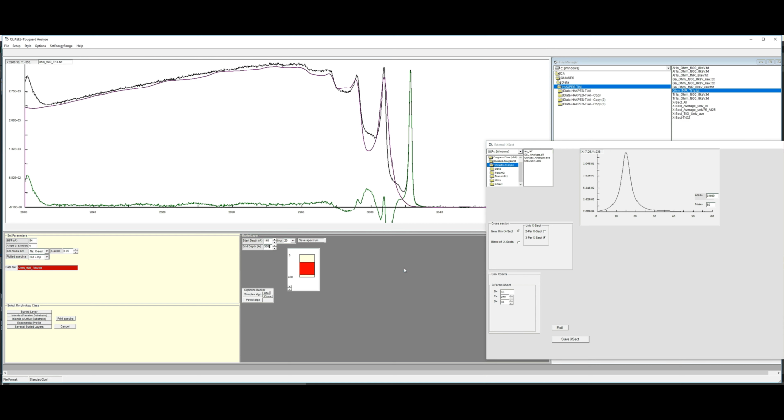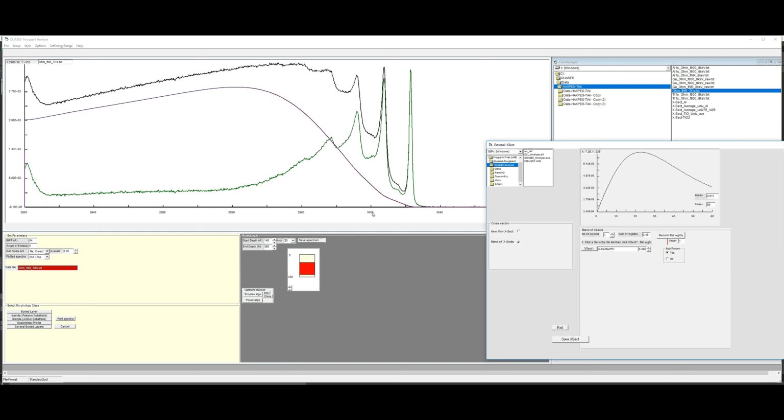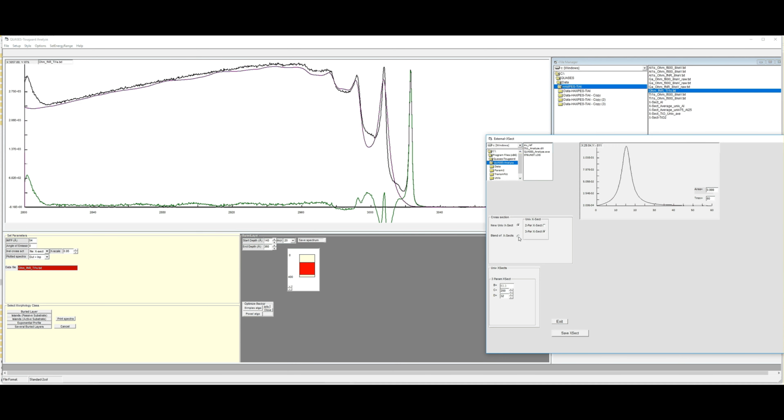We could, instead of using the 3-parameter cross section here, also use a blend of cross sections. So we could take a cross section valid for titanium and one for aluminum and make an average of these. This is what you can do with this facility in the software here, the blend of X sections. Let me illustrate that here.